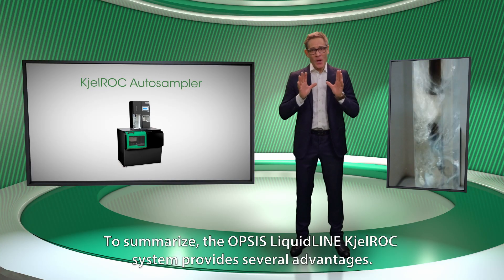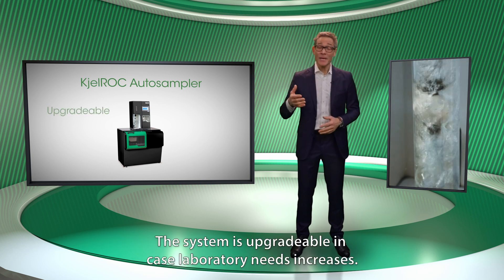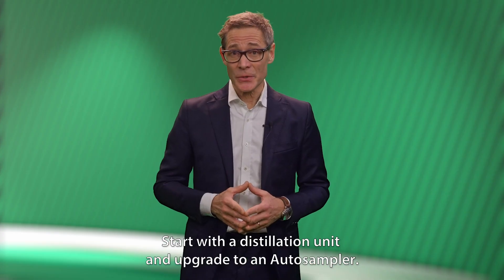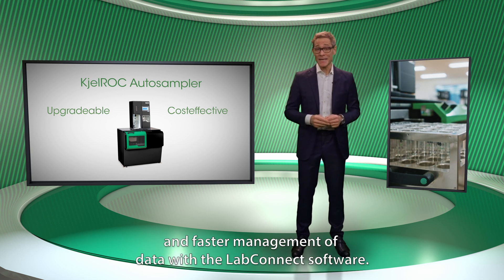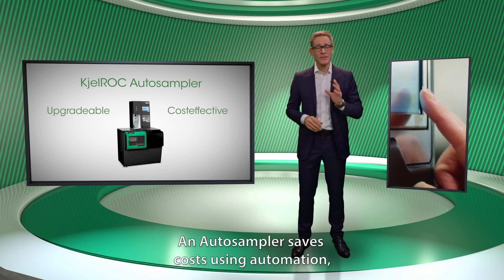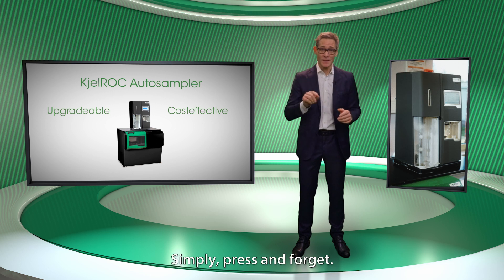To summarise, the OPSIS LiquidLINE KjelROC system provides several advantages. The system is upgradeable in case laboratory needs increase. Start with the distillation unit and upgrade to an Auto Sampler. An Auto Sampler saves you costs with faster analysis turnaround and faster management of data with LabConnect software. An Auto Sampler saves costs using automation, and less operator time is spent with the instrument. Simply press and forget.